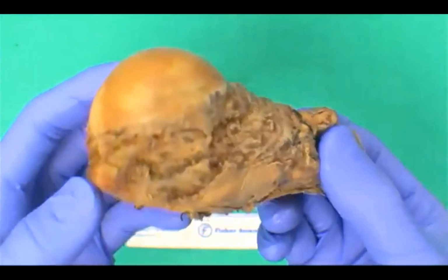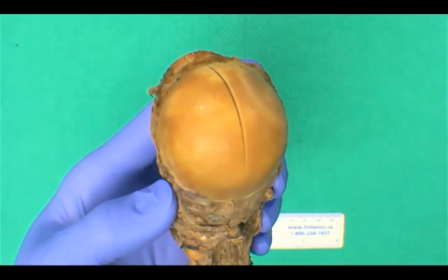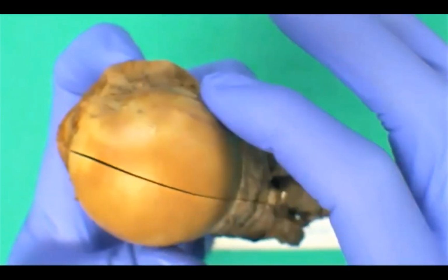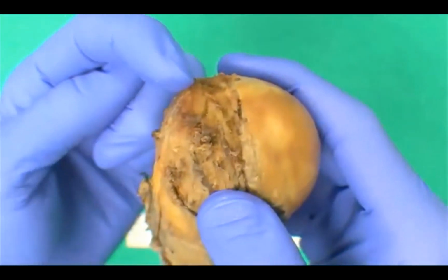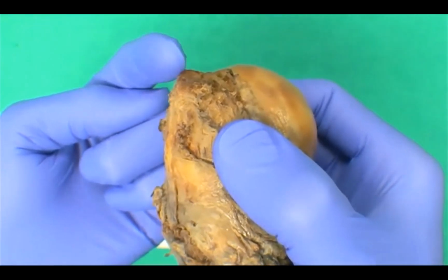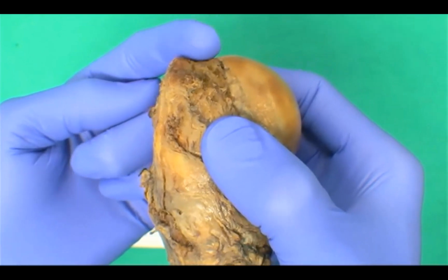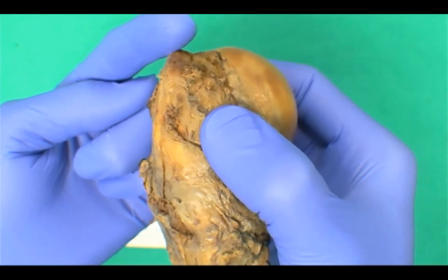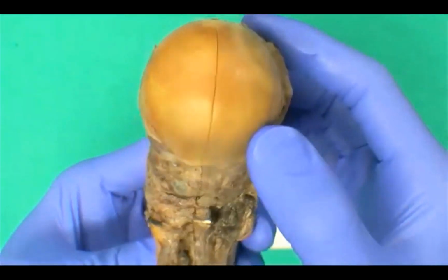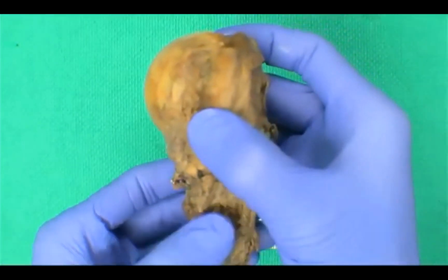And just walking through the anatomy, you can see that the humeral head is here. It's nice and shiny. It's covered in cartilage. Anatomically speaking, the humeral head points medially. Up on the side here, you can see that the contour of the bone comes up a little bit. This is the greater tuberosity of the humerus, and that will be lateral on the specimen. By virtue of these two elements, we can see that this can either sit like this or like this.